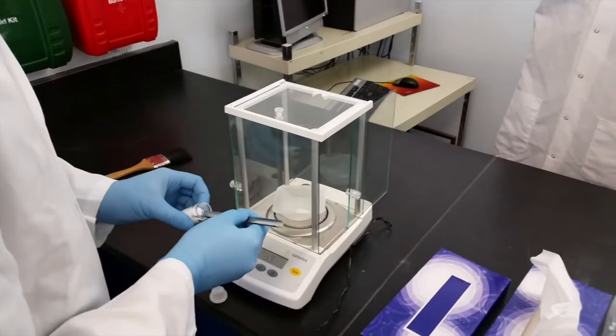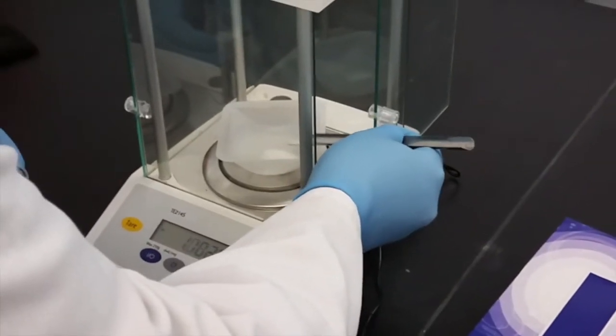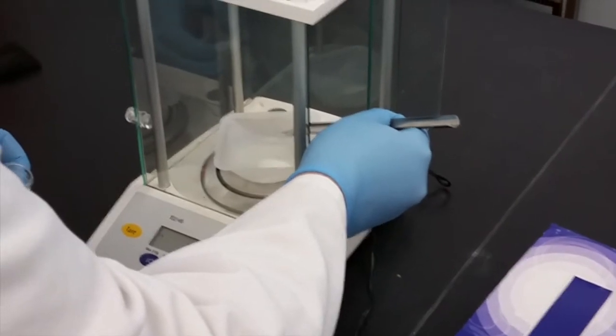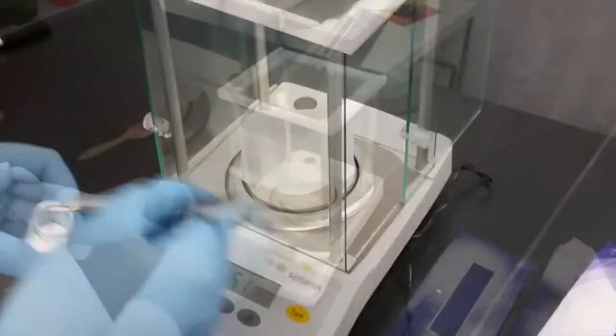When I say around, it means a mass very close to 1.5, but as long as you record the exact mass you obtain, that's good enough.